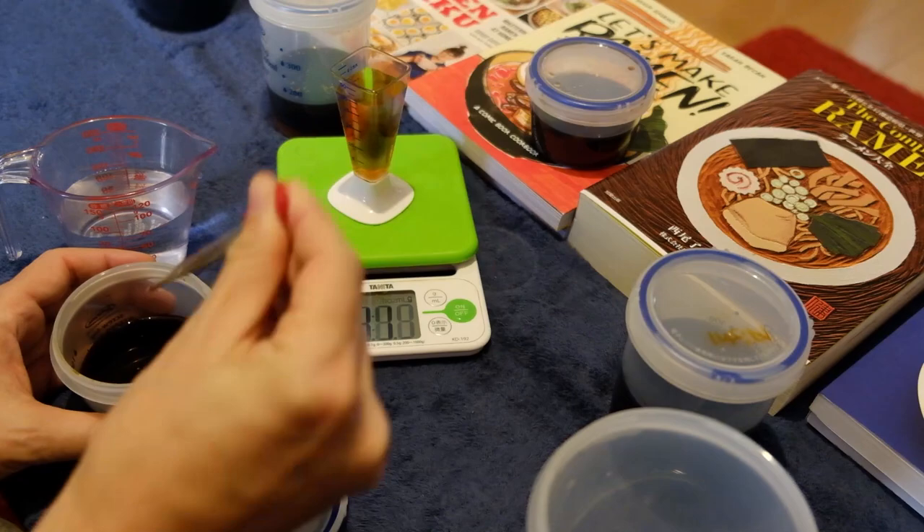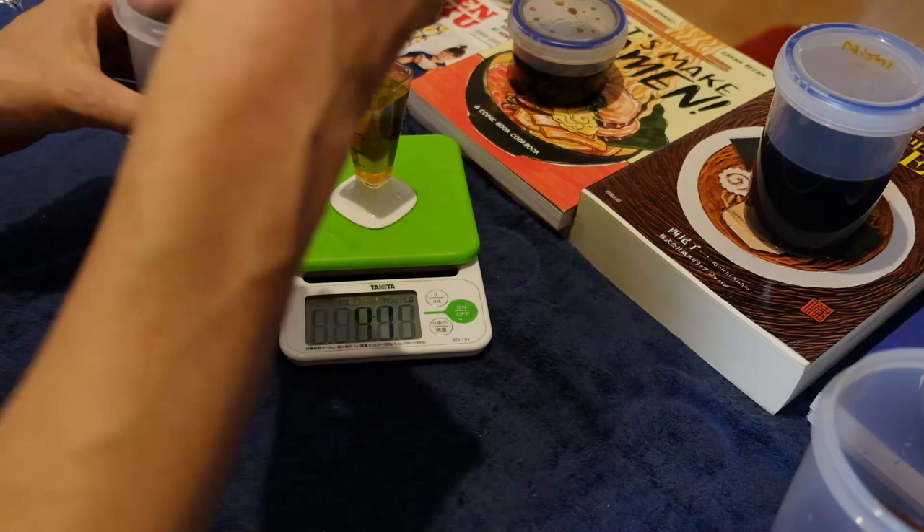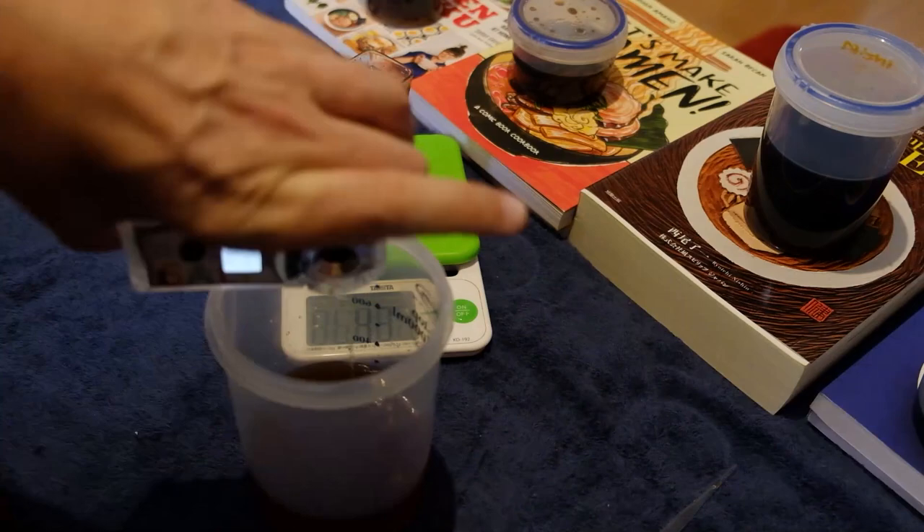One cup of tare will be enough for around 8 servings of ramen, so you might as well make a lot and keep it in the fridge. The Atago unit is very simple to use. Zero it out with some water, wipe it down, and you're ready to test. For tare testing, I diluted each down to a 10% solution. A sauce using lots of shoyu — soy sauce — for my tare recipe, the final number for salt was 1.36%.